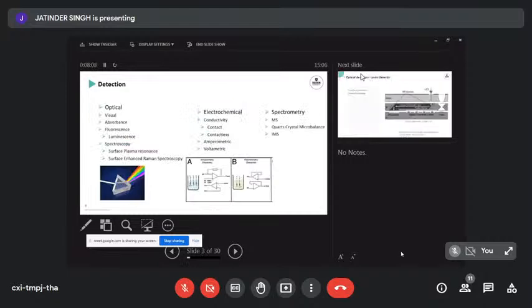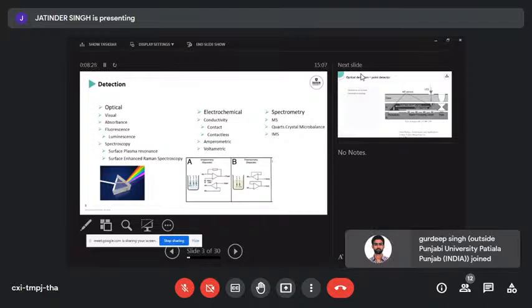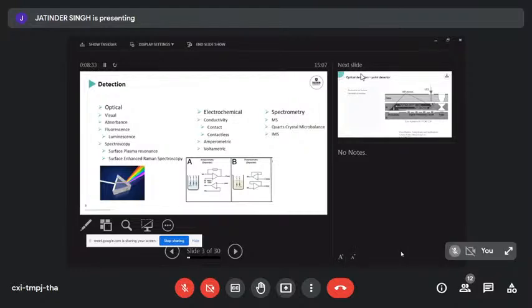So we've got a whole toolkit, and Professor Malik already went through it a little bit this morning. But if we kind of categorize them, we've got the optical detection techniques, and we've got a lot of them. We've got beautiful detectors sitting in our eyes here. COVID testing, again, we didn't need a detector at home. We just had our eyes and could see positive or negative. Very, very useful way of detecting and reading out an analytical assay. If we want to go a little bit more advanced, we can measure the absorbance of light. So we can measure colors, we can measure UV absorption.